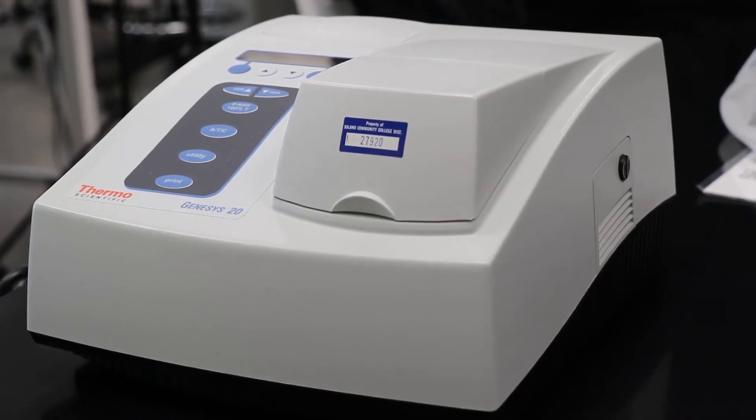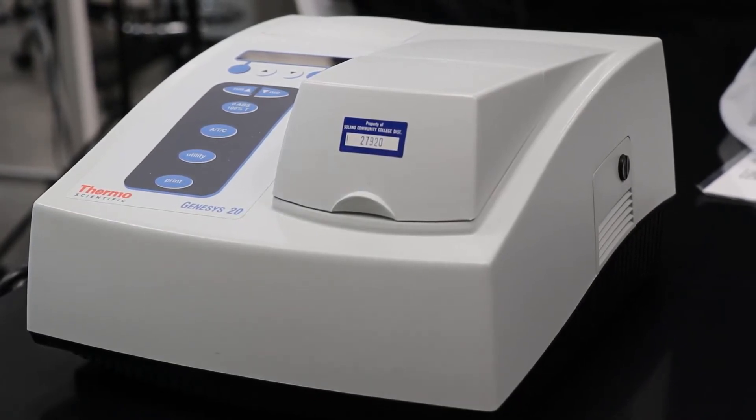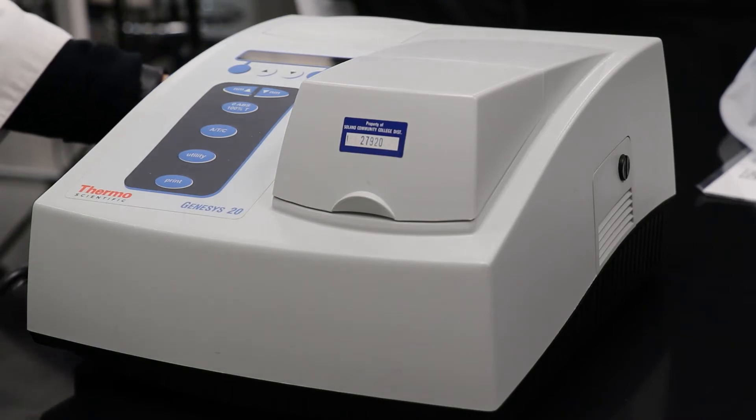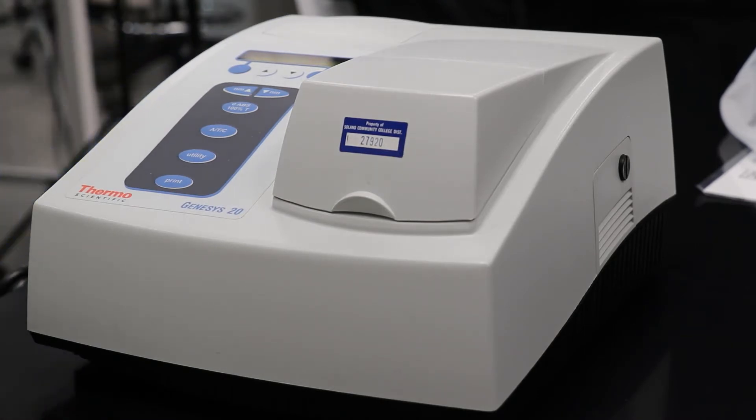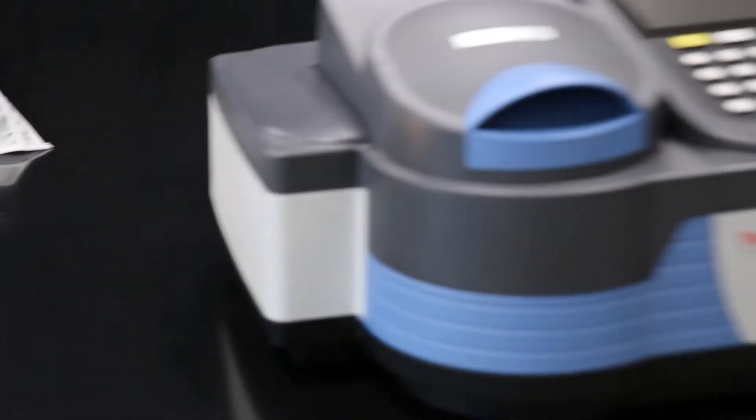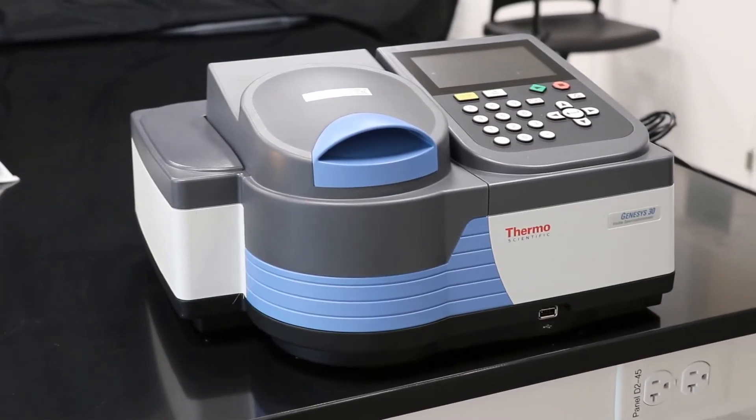It's best to turn on the spectrophotometer and let it warm up while setting up the experiment. This is a Genesis 20 and it turns on in the back. You may use this model or the Genesis 30, which turns on at the side.